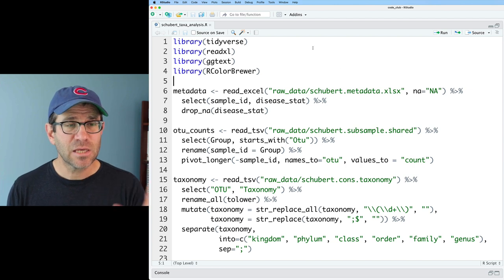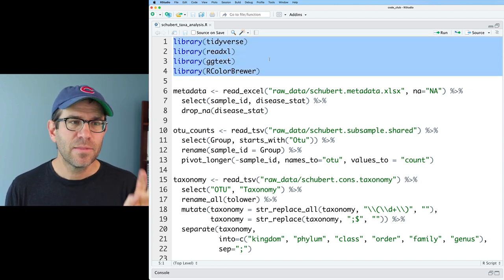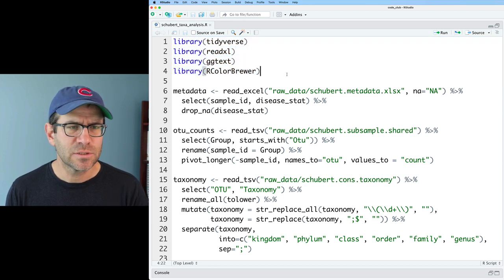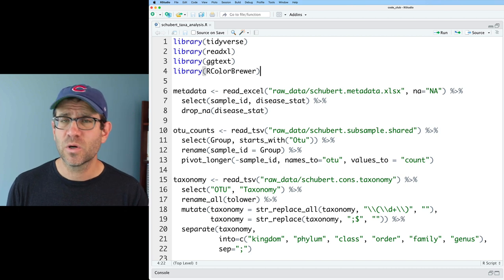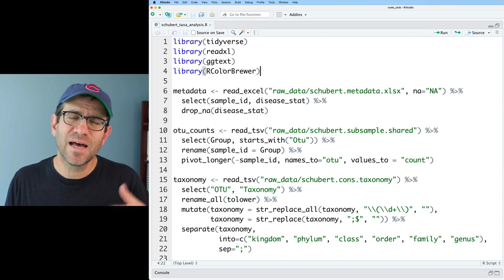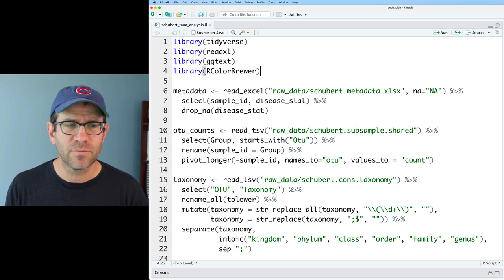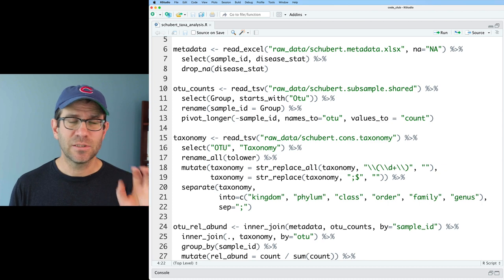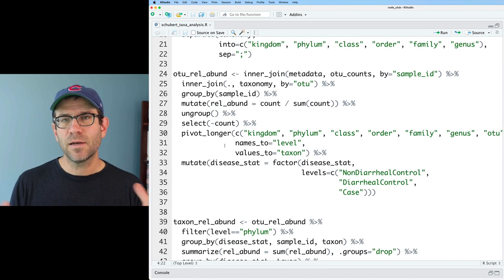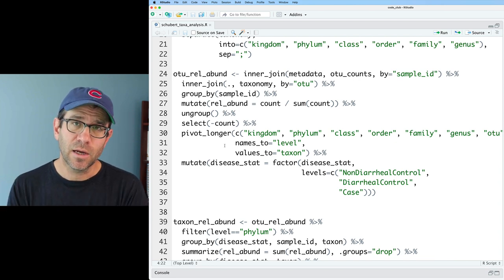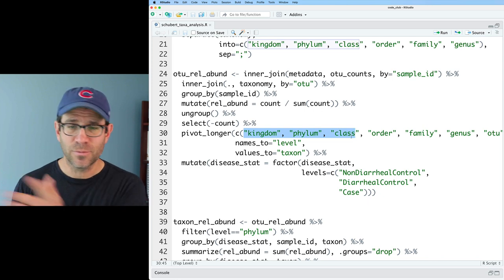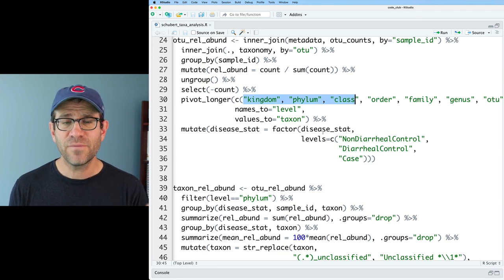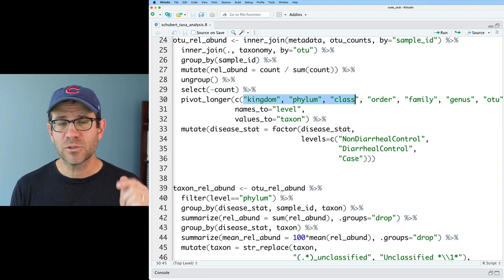In this code, you'll see that I am loading four different libraries. They are all installed with the tidyverse. Some of these though, like readxl, ggtext, RColorBrewer, you have to load the package into the library because it's not loaded automatically when you load the tidyverse. We then get in our metadata, our OTU counts, our taxonomy information. We then use all that information and join it together into a big data frame where we are also calculating the relative abundances. We have data at the kingdom through OTU levels. And then we set a factor of non-diarrheal control, diarrheal control and case.